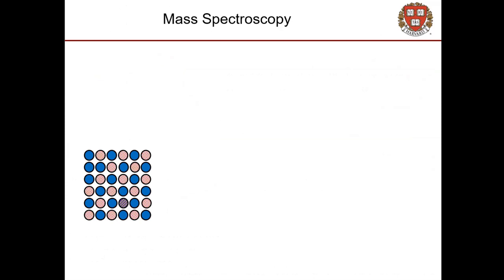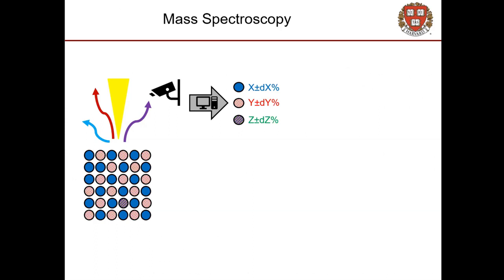Now, one way one can address this is to direct a beam of radiation towards our material, causing it to emit light. This light can then be collected using some sort of light sampling detector, and using our knowledge of the physical process that generated it and our detector hardware and so on, we can turn this into a composition and species list for our piece of material. This is part of a class of spectroscopies we've already heard about a couple of times in this series, photoemission spectroscopies. But what if there were a more direct way, a more brute force way?